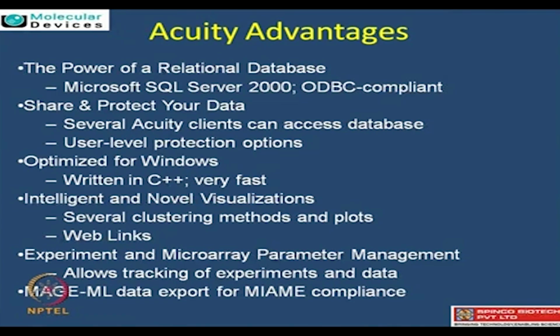So I guess the last two points which you mentioned, one is tracking the data based on the experiments, right? I think that's very important. That's also depending upon the need of the experiment. One needs to in fact track and make the software learn your experiment so that one can actually apply the same knowledge for the various slides throughout to track that data set. Yes. Now, the second point which you mentioned about MIAME compliance, I think that's very important because one needs to do all the quality control checks and overall data analysis with the uniform guidelines provided. So one has to adhere to those quality control checks.